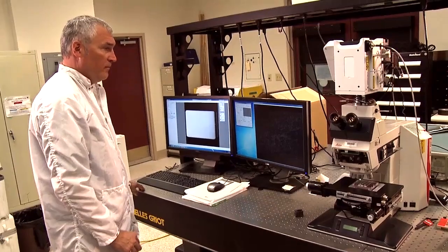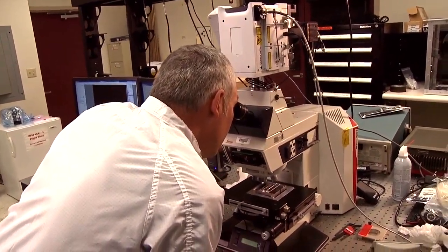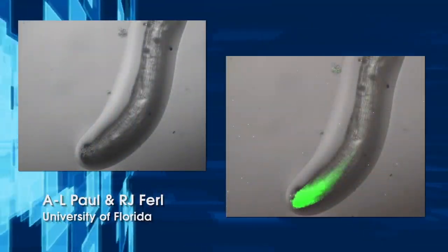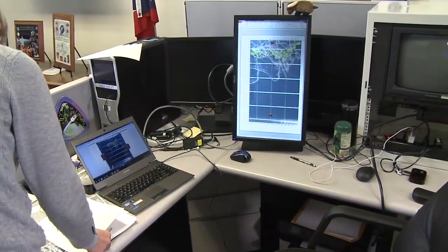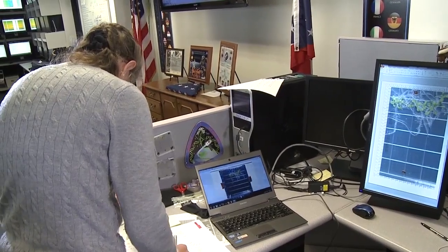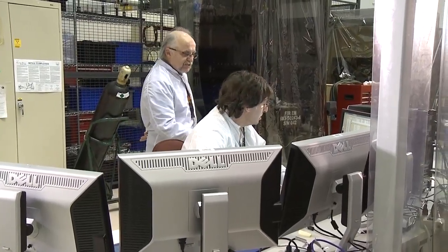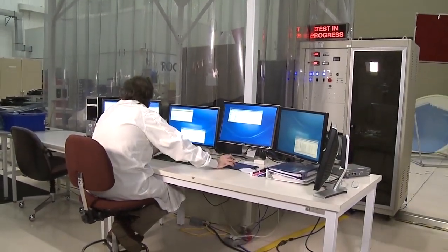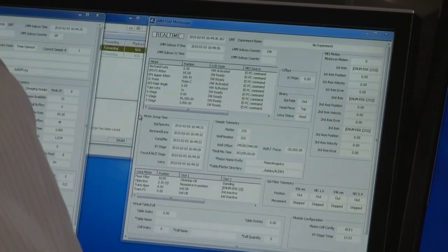Glenn Research Center comes into the deal because they have the very specific type of hardware that we'd like to utilize on orbit, the LMM. The light microscopy module now allows us to take a closer and deeper look at some of the gene expression patterns that can be revealed by some of these fluorescent reporter genes that we've engineered into our experiment. GRC handles not only the experiment itself from the imaging point of view, but it has also been very good about allowing us access to the people and to the ground unit for the LMM, both before to tweak the systems and also to test some of the new parameters that we would like to explore.